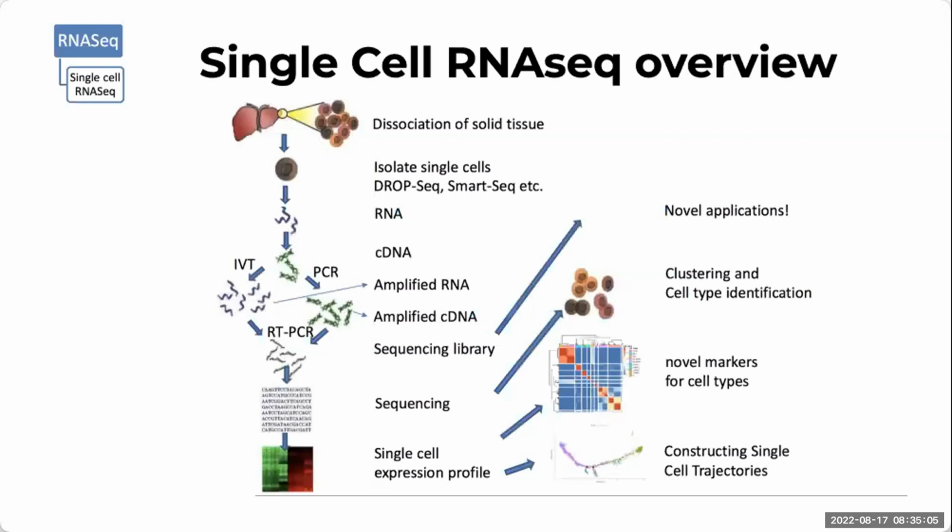If I can summarize the whole of a generic single cell transcriptomics pipeline, analysis and quantification, there are some extremely important steps involved, and I am just listing out some of the very important steps; we will go through them one by one. First we have to extract the cells from the tissue, obviously, and then from this tissue we have to isolate the cells as single cell entities.